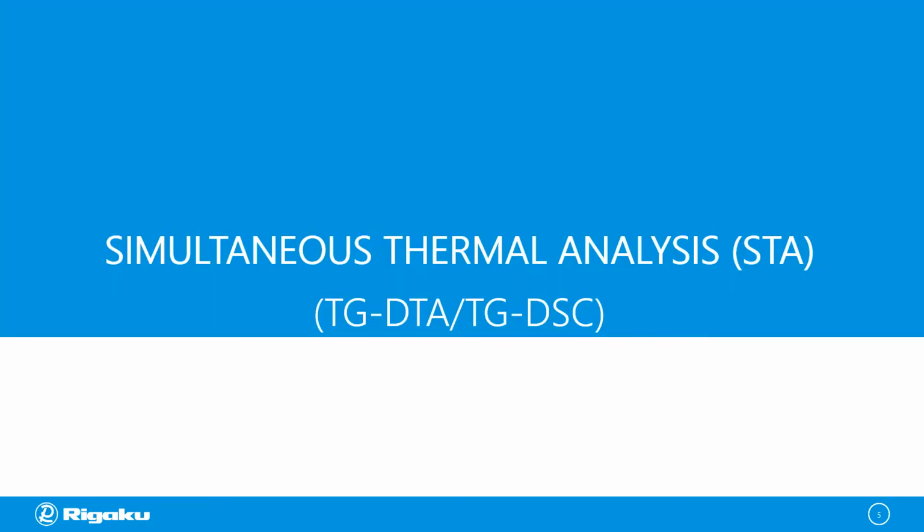From this slide onwards, we will be talking about simultaneous thermal analysis or STA, composed of thermogravimetry combined with differential thermal analysis or TG-DTA, or thermogravimetry combined with differential scanning calorimetry or TG-DSC.